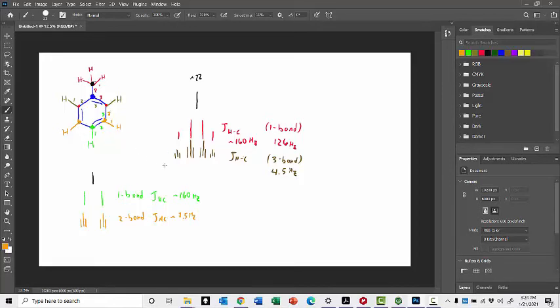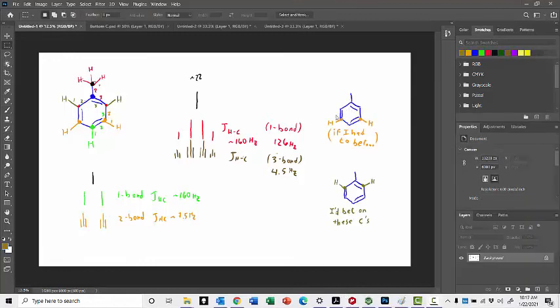So, can I easily understand what's going on? No, not particularly. So as you can see, I've decided after the fact that this is more likely to be the nice doublet of doublet sort of carbons, and this is more likely to be the doublet of messes sort of carbons. And the reason for that is that these carbons have nearby hydrogens that can affect them much more greatly. I can easily justify why this carbon would be seeing 3 hydrogens here, 3 bonds away, 1 hydrogen here, 3 bonds away, 1 hydrogen here, 3 bonds away, and that total of 5 nearby hydrogens that are affecting it at the same distance should make it look like a sextet.